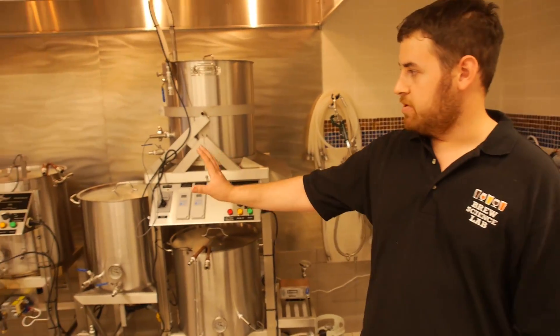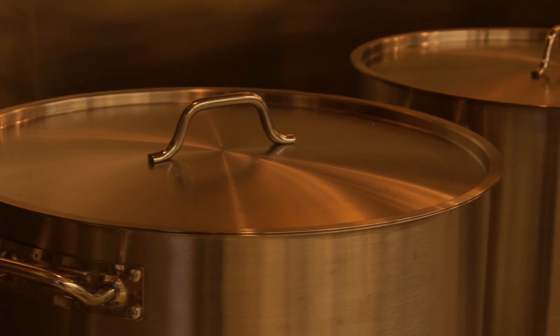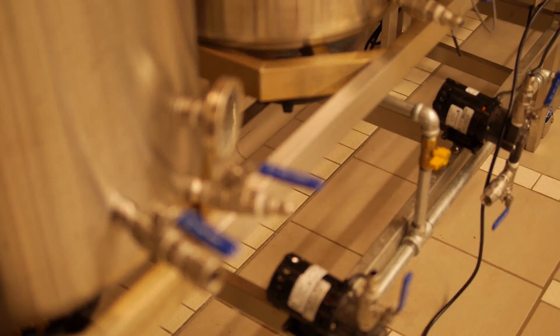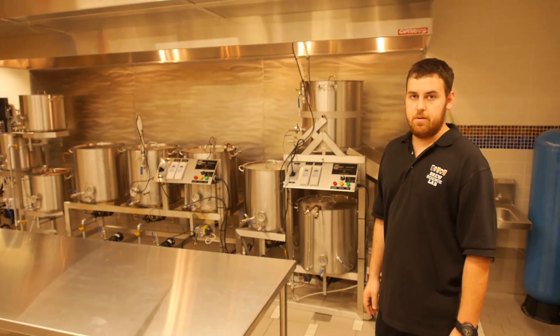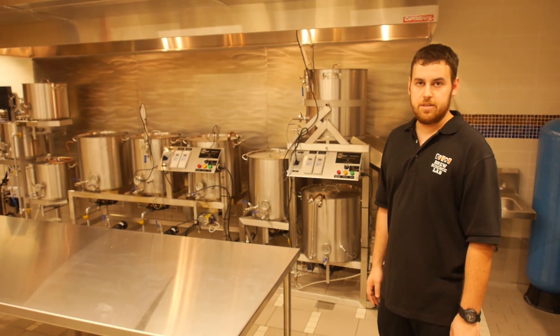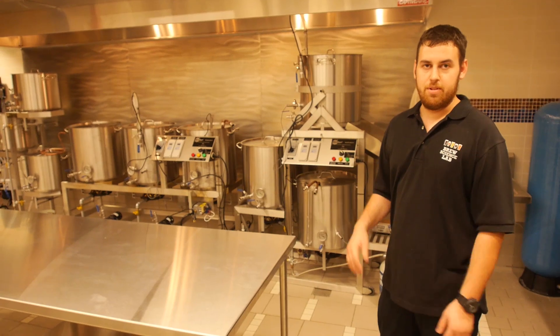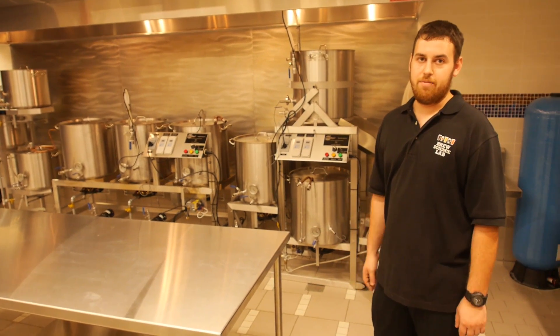These are our three brew systems. Two of them are 27 gallons and one is a 10 gallon system. They all have pumps and can moderate their heat within a degree to two degrees. It's a lot more advanced than what we had before, and we're going to be able to put a lot more consistent, great beer out for FYU.